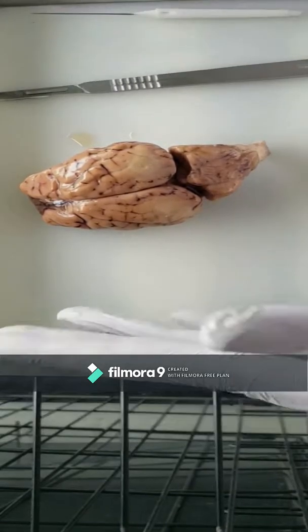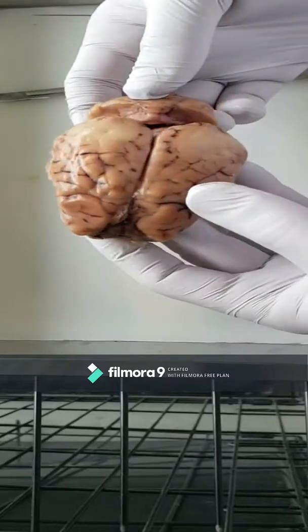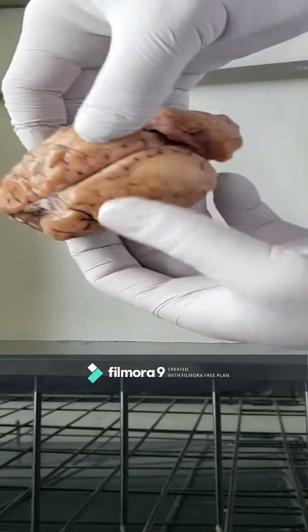So, I'm in my garage because of the smell of formaldehyde; my wife is not a fan of it. But this is the sheep's brain that was supplied with our kit.